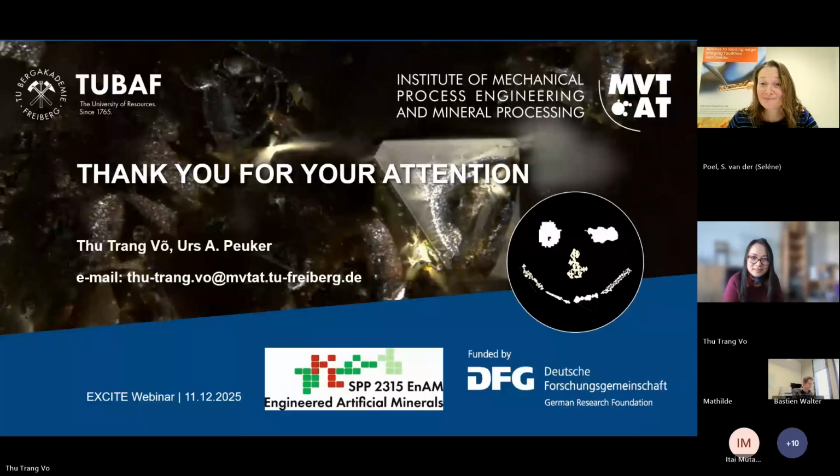Please come in. Yes. Hello, thank you. Thank you very much for a very nice presentation. I would like to ask, you are using the compression stage from Deben company? Yes, I'm using from Deben, yes. So I'm a bit curious because I've never seen it in practice. How easy is it to operate? I've at least heard that it's maybe not so user friendly, and also I'm asking if you can adjust the force precisely on your samples, or is it difficult with this kind of stage?